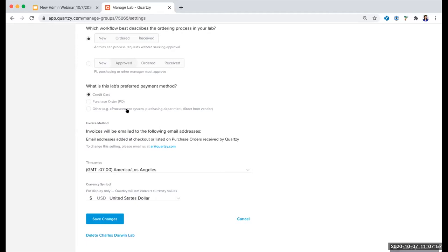Lastly, we have what we call the other checkout method. This is the best option for labs where a centralized purchasing department or purchasing person is responsible for sending POs to suppliers. What you might do is submit a requisition to them and they email a PO to us at orders@Quartsy.com. Just like with the PO method, invoices are sent once the order ships, and we'll give you more specifics about that buying process later as well.